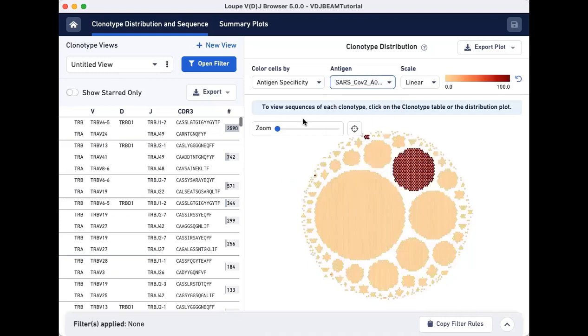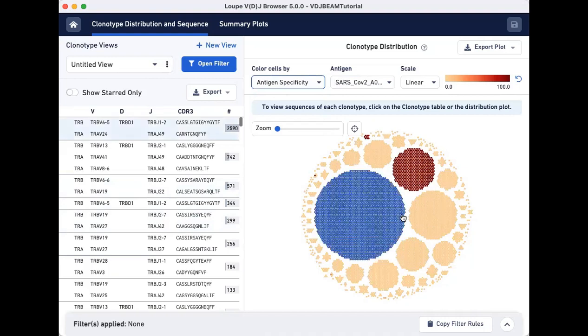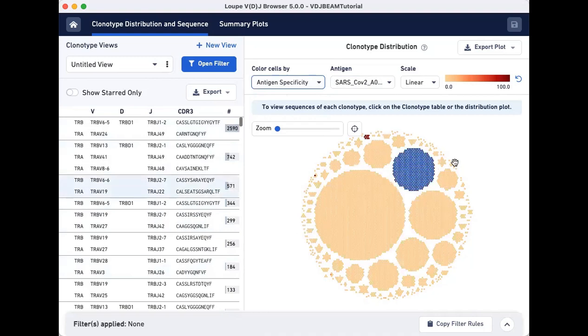Make sure that the color cells by drop-down menu is set to Antigen specificity. As you can see, all cell barcodes are now assigned a color based on their antigen specificity scores for SARS-CoV-2. Lighter colors indicate low scores, whereas darker colors are cells with high antigen specificity scores.